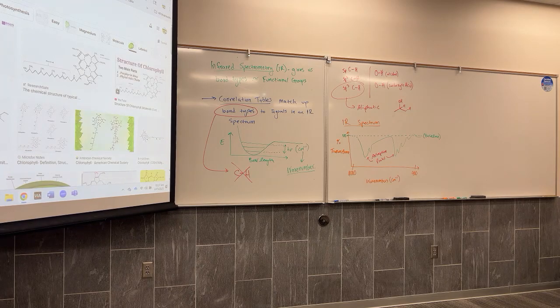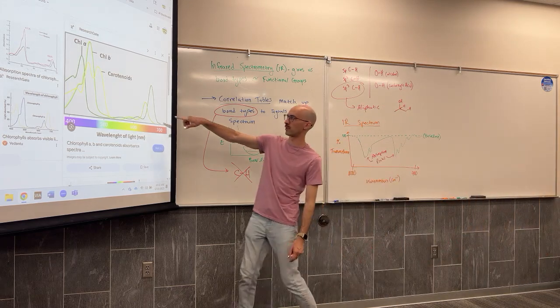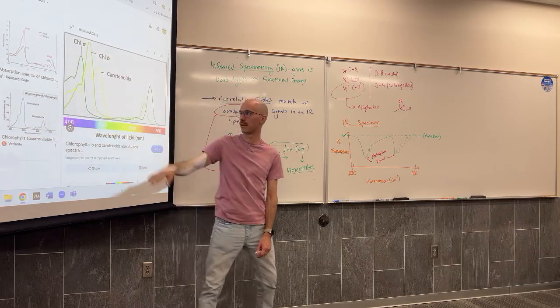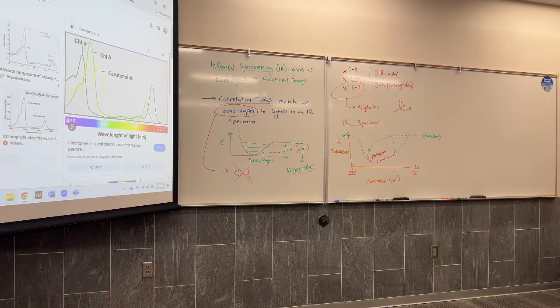They do absorb in the infrared, but not for the same reasons. And if you look here on their absorption spectra, you can see they absorb really well in the red. I guess they also do absorb in the blue and violet. But that's why they enhance the color green. Did that answer your question?